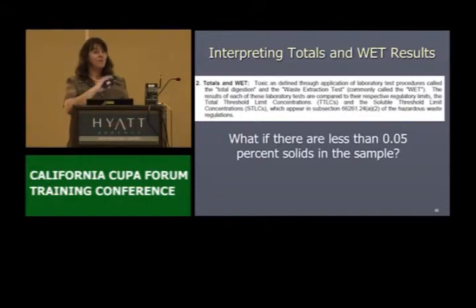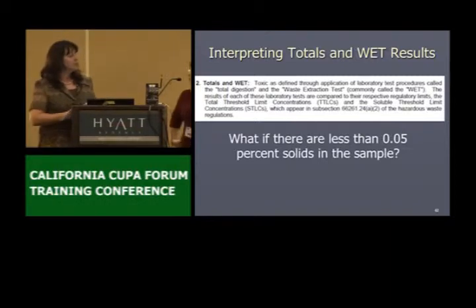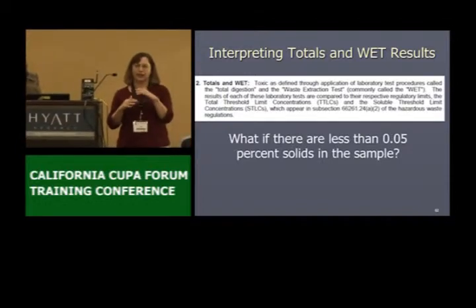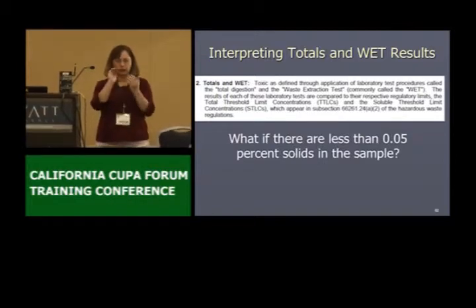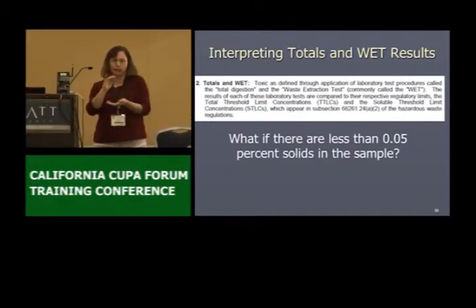Here's something where you can get messed up a little bit, and this is something I was told early in my career, that TTLC is the same as STLC when you're testing liquids. Well, I fell down on that one, and I messed up on a case where I just ran TTLC, I didn't run STLC, and then those sample results were disputed because they said, no, it's not STLC, it's TTLC. So I'll let Patty talk a little bit about the filtration step that would occur in running the STLC. An STLC test is based on just that soluble fraction, like I was talking about the TCLP, where we do that 1:20 ratio and let it settle, and then we filter it and just analyze that water, or the liquid portion of it.